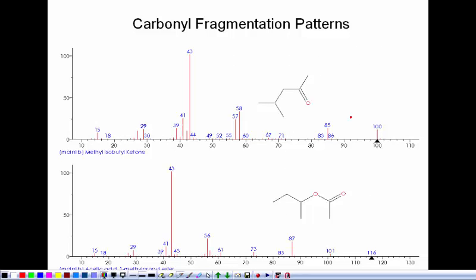Okay, so what I'm going to do then, as I said, is I'll give you some mass spec. I'll ask you to write out how the molecule cleaves and what fragment it corresponds to, and all the fragments have to be carbocations. They can't be radicals because radicals don't have a charge; they don't move in the mass spectrum. You can't determine their masses. Okay.